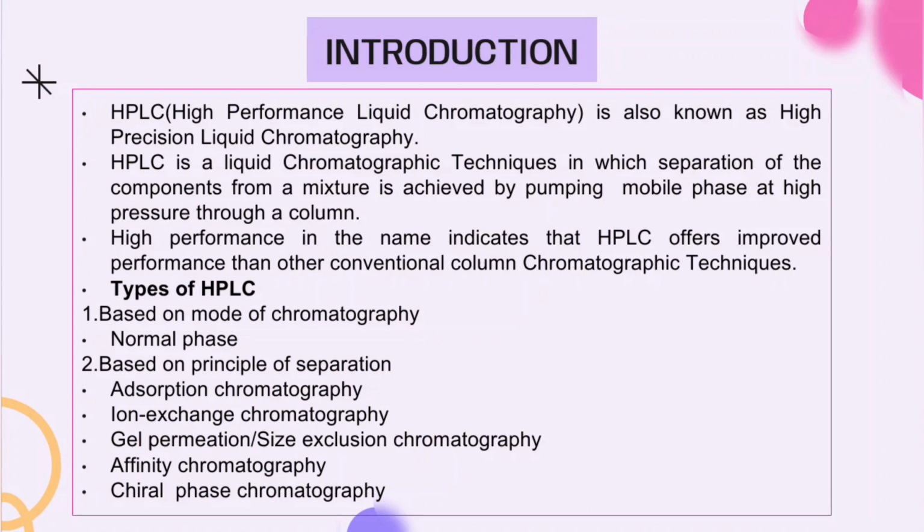Adsorption chromatography: in this, separation depends upon the relative affinities of solute molecules towards the stationary phase. In ion exchange chromatography, the principle involved in separation is reversible exchange of ions between the ion exchanger present on the solid support and ionic solute molecules.